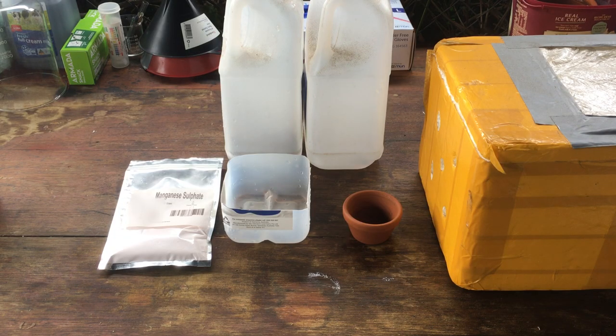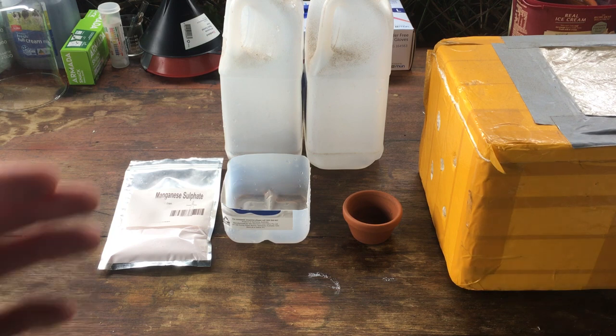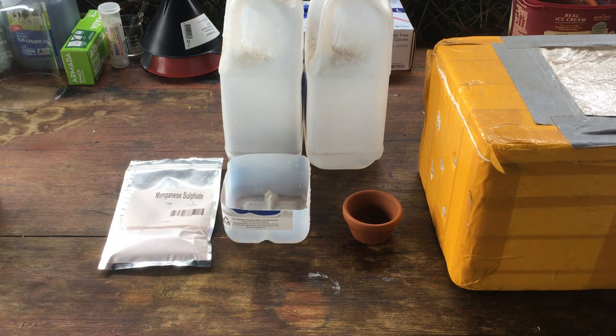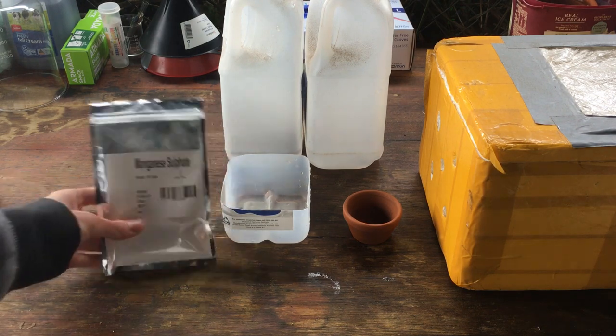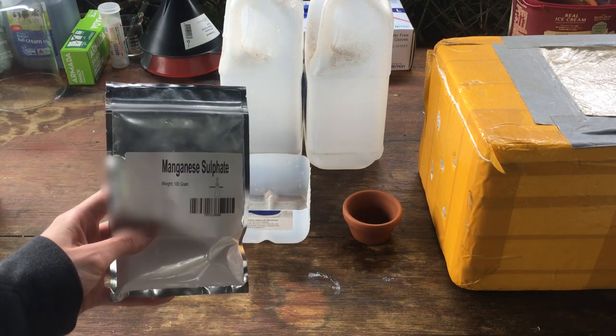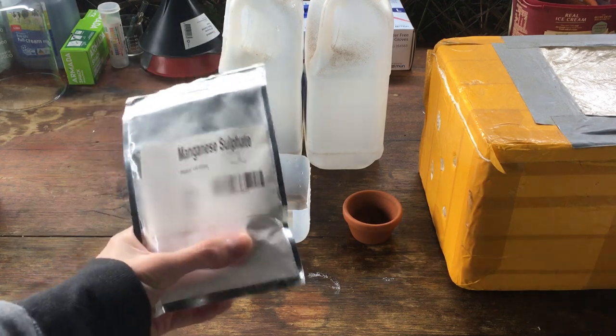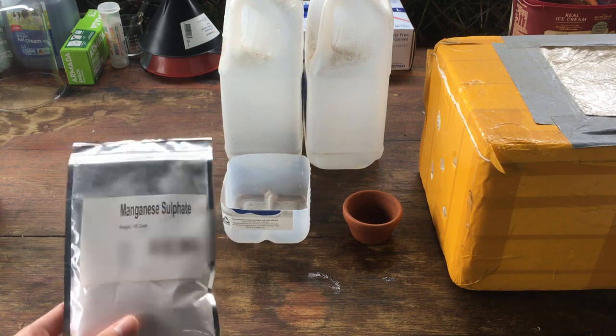What we're going to be doing today is something for a future video, and in that future video we're going to need manganese metal. So what I've got planned is we're going to try to convert this manganese sulfate, which I bought online, into metallic manganese.